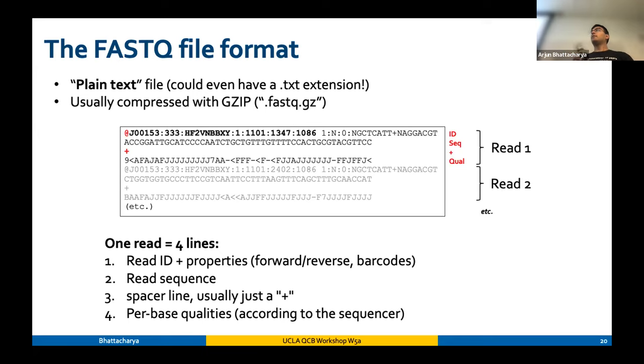Just a question on the pipeline of prepping samples. The collection of RNA types, that's usually something that you would buy a kit designed to do that. Exactly. Yeah, I think for Illumina at least, the small RNA kit just gives you better ways of probing the small RNAs, so they're more amplified than the other RNAs, which they call contaminant RNAs, even though they're real stuff there.